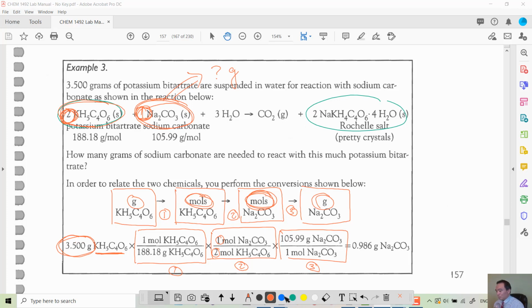So similarly, if you use a different number, for example, rather than using 3.500, if you had a number, let's say 3.950 grams, when you do your calculation, the only change you should make is to replace your 3.500 in this example with your number, 3.950 grams.